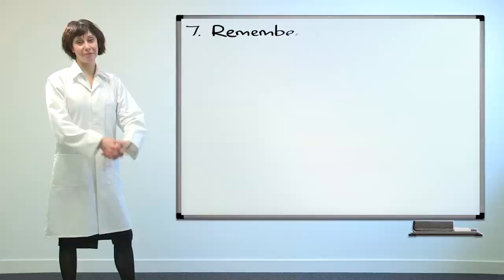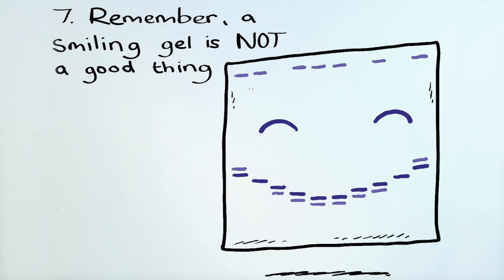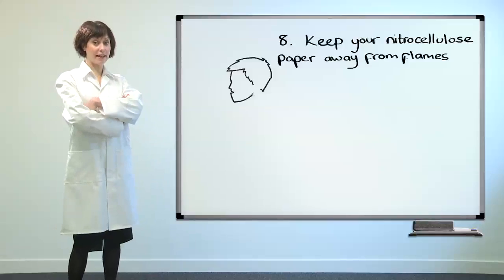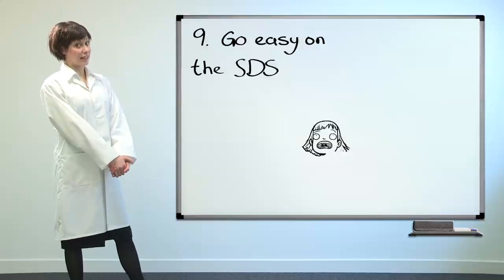Remember, a smiling gel is not a good thing. Keep your nitrocellulose paper away from flames. Go easy on the SDS.